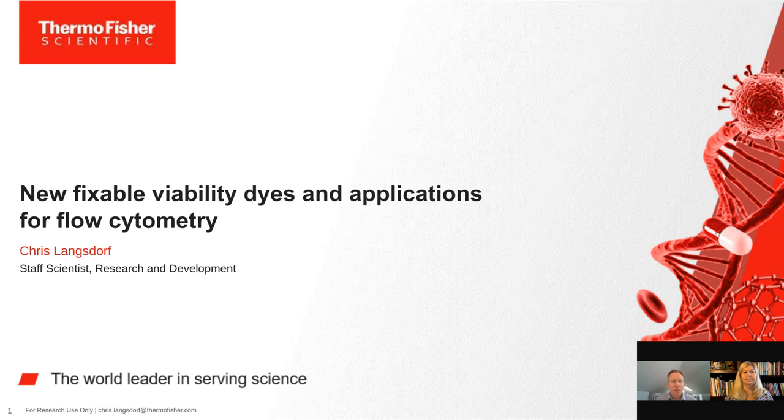Thank you, Susie. I think there are a couple of ways to compensate these live dead dyes, and compensation becomes critical as we get into these larger panels with many markers and many colors. So I showed one way to set compensation, and that's using our ARC amine reactive compensation beads that are designed to be labeled with amine reactive dyes such as these, and then just run as a single color control.